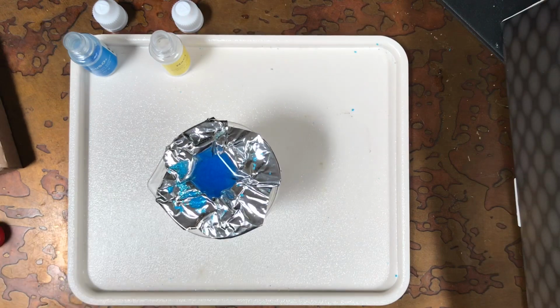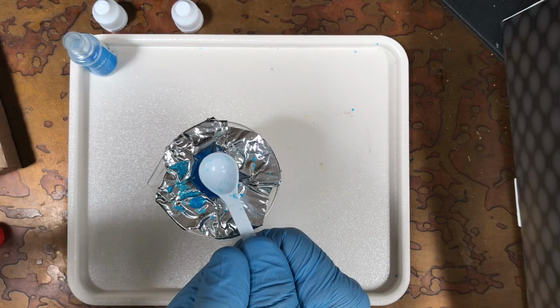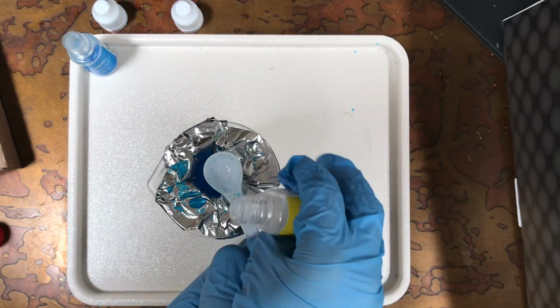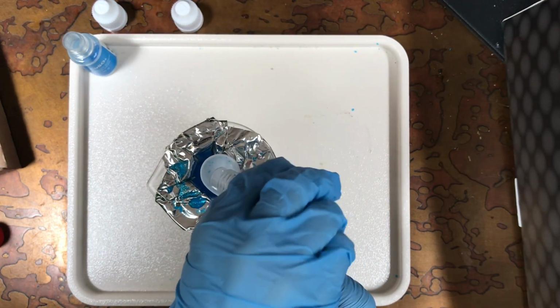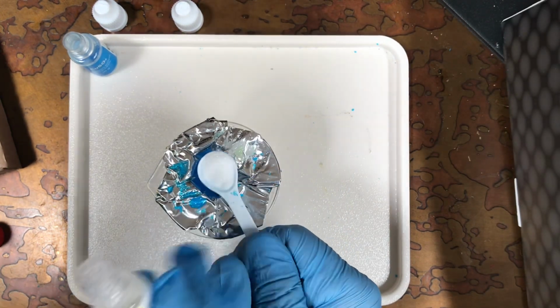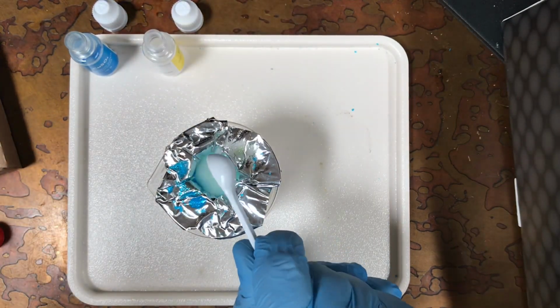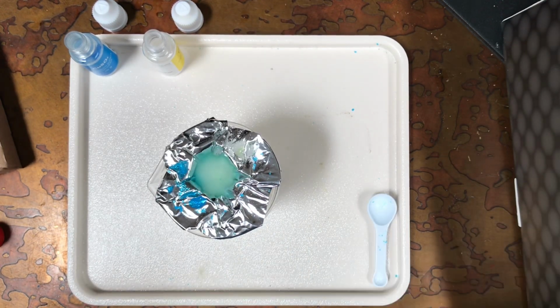As you can see, nothing happened. Now we are going to add salt, or sodium chloride. As you can see now, it has turned green for some apparent reason, because there was nothing yellow in there to turn it green.